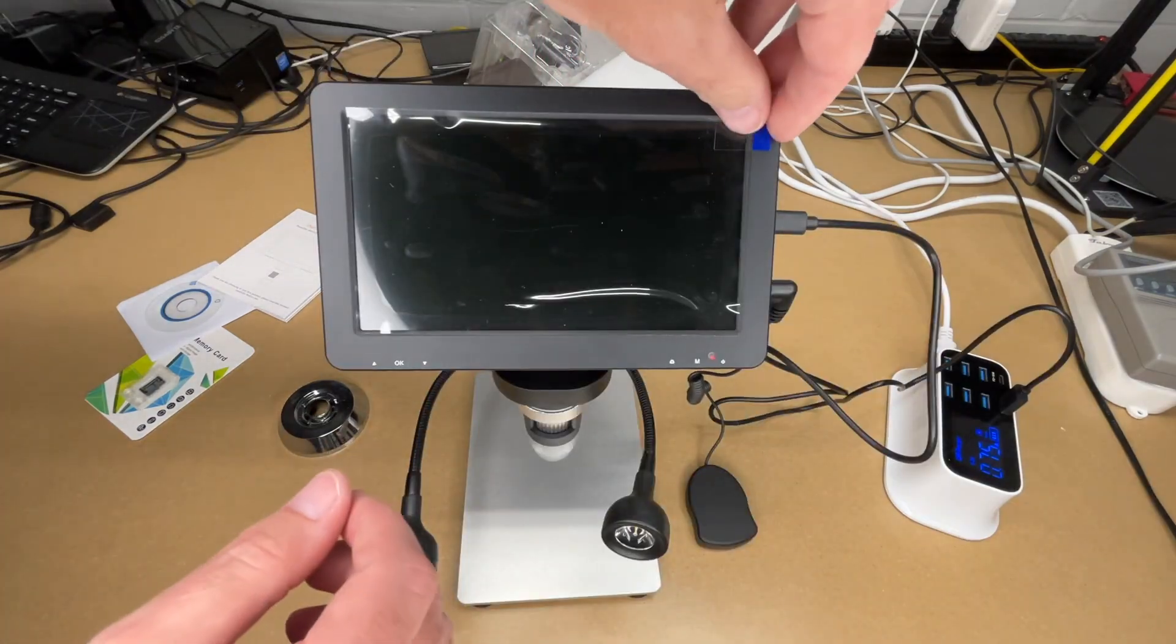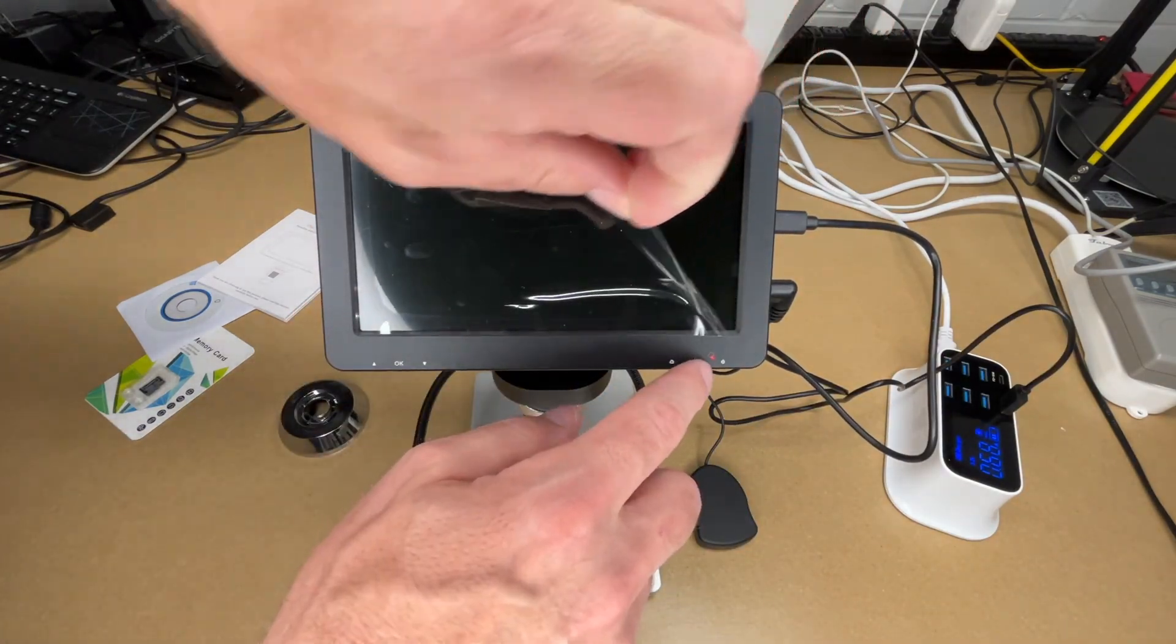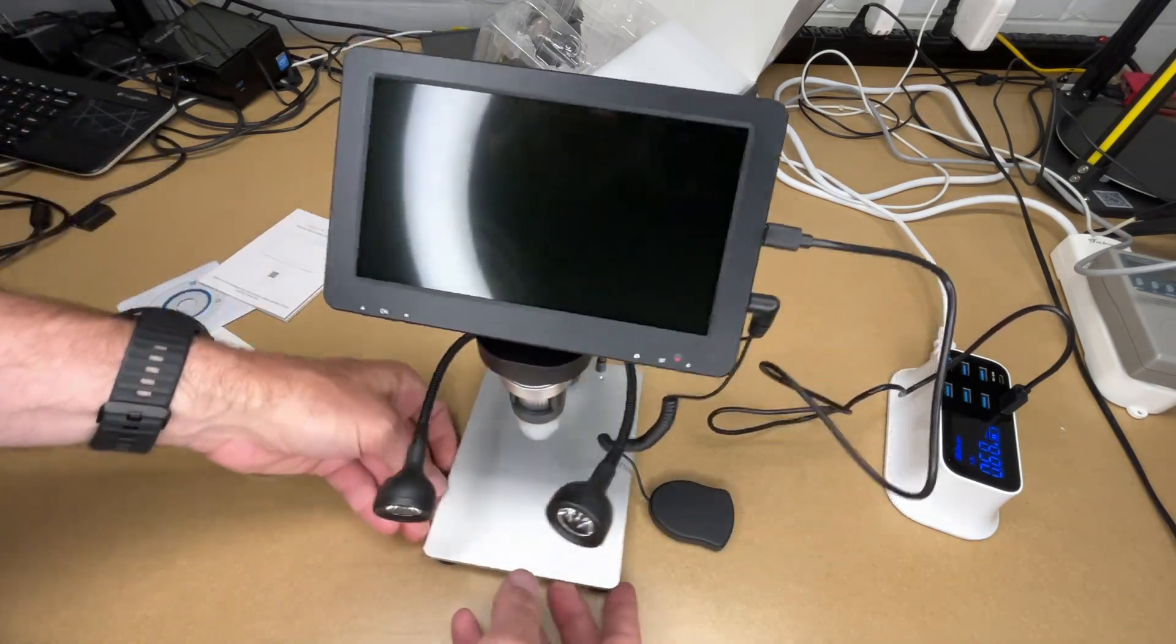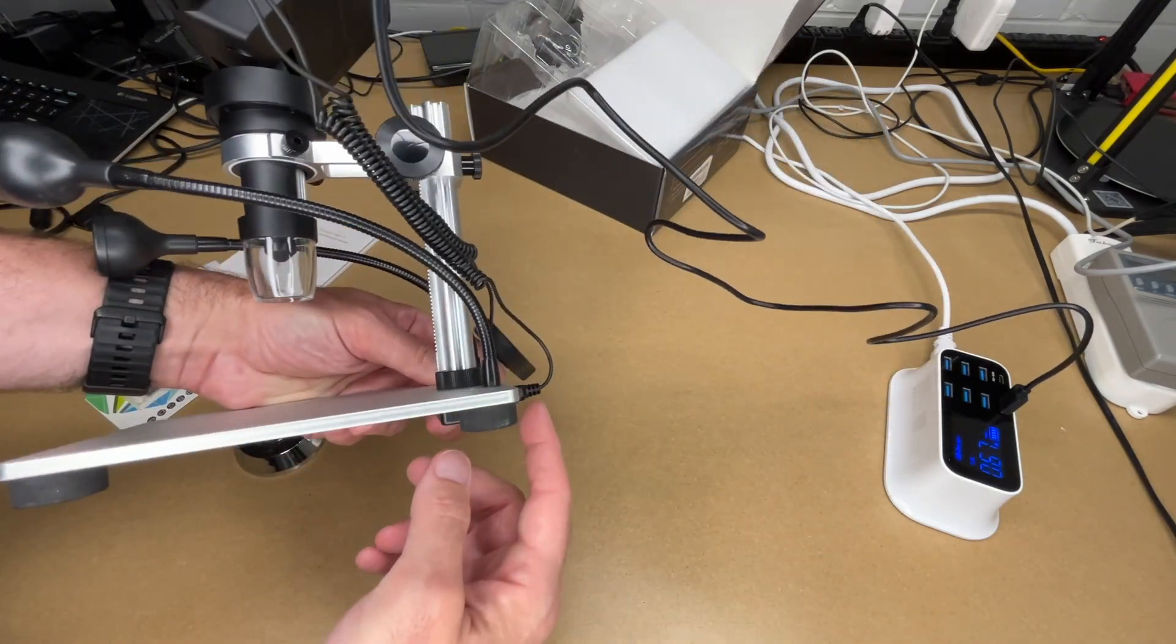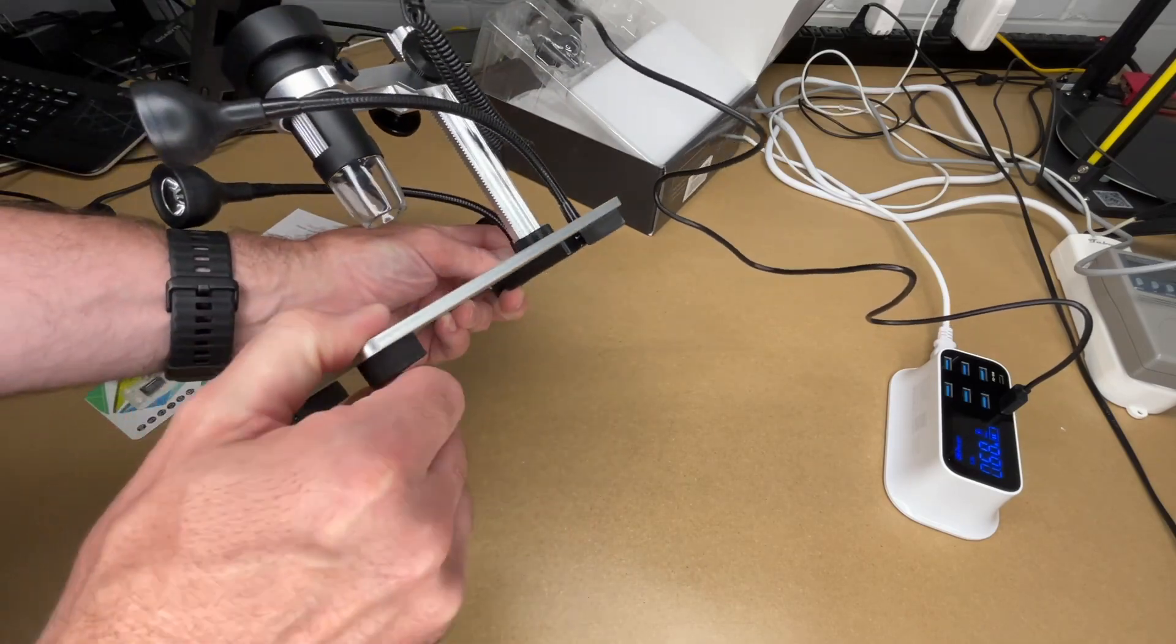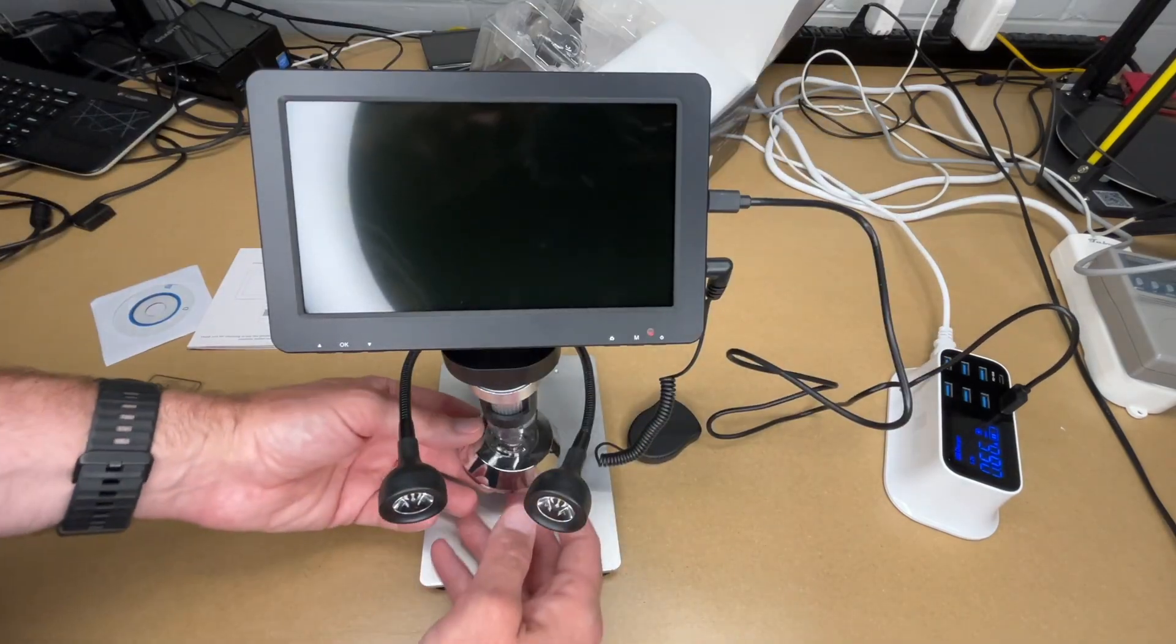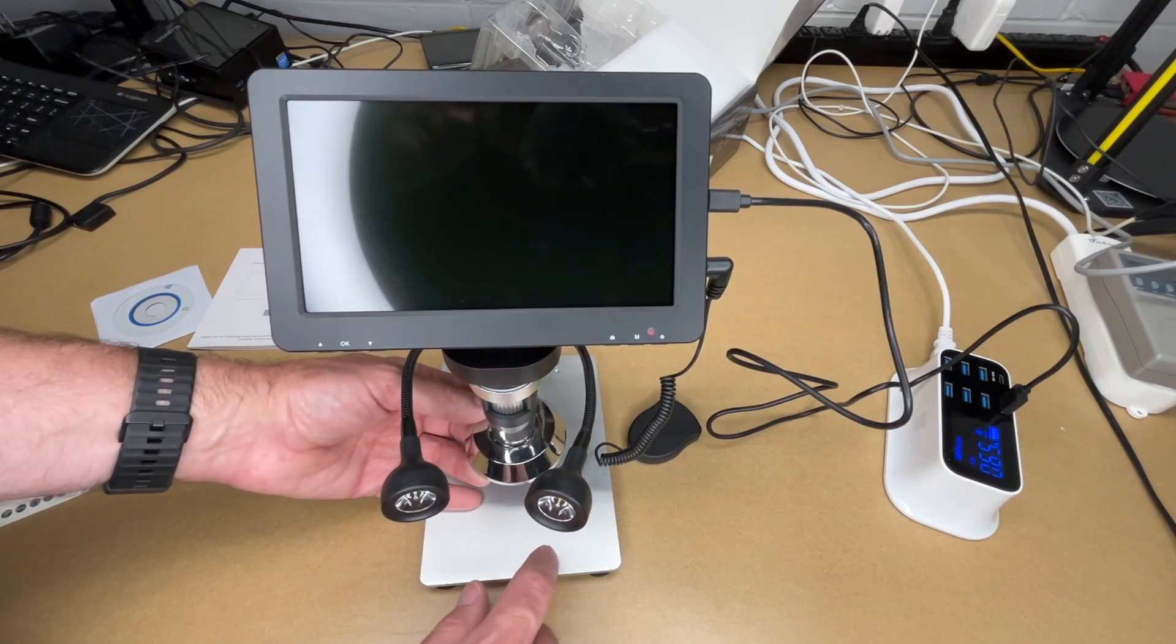Peel this plastic off here. We can see the power light is on. And the micro USB port is right here on the side. So I do need to make sure I don't tilt this backwards so I don't hit that. And the bottom has these big foam feet on it. So this is to put on the end here if you're using this without this base.